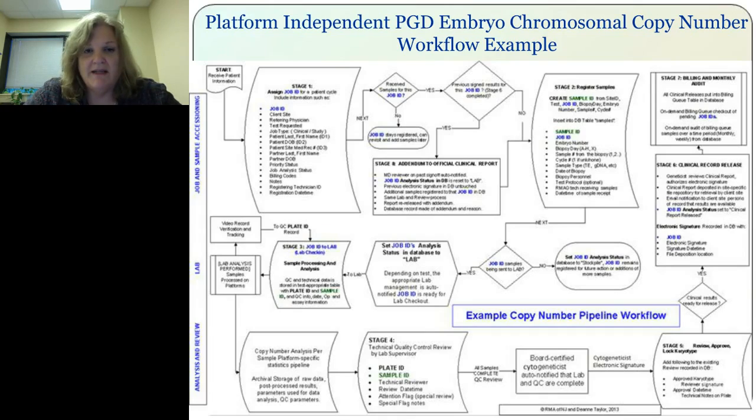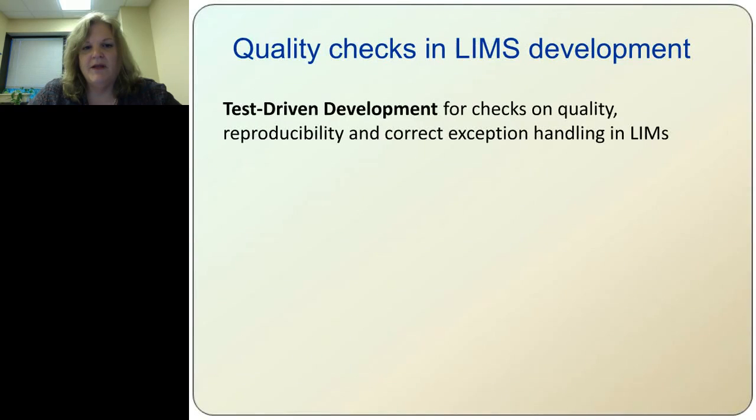This is all automated, and there's very little human interaction except for the beginning of the pipeline and the end of the pipeline. There's a couple of different check-in states, but usually they're automated, and it's a binary, is it checked in or not kind of setting. So we tried to take out the human element as much as possible without completely removing it from controls. So there are some steps where a person could step in and change something, but on standard operating procedure, that's not done.